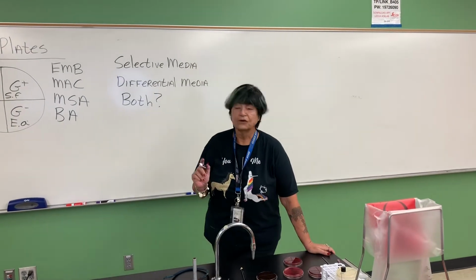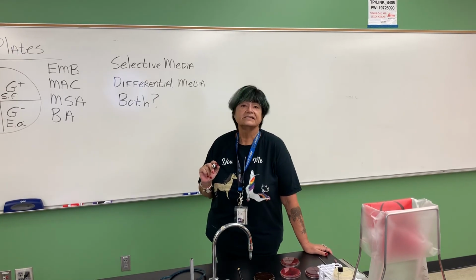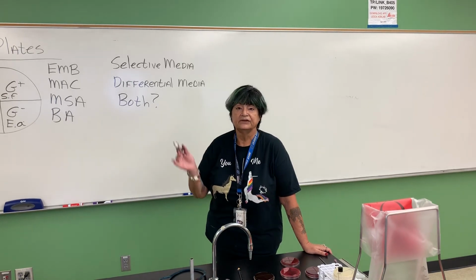So I'm going to go ahead and spread the bacteria on, not on camera, as I just showed you that before, but that's what I'm going to do. I'm going to zig the bacteria on there, on the plates. After they grow, I'll show you a picture of the finished product. And then you decide if they're selective or differential.